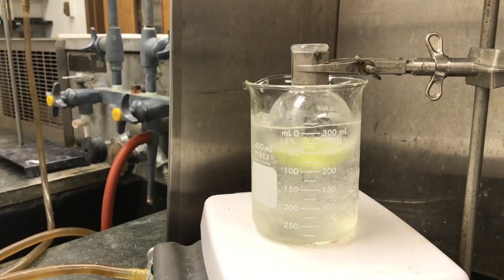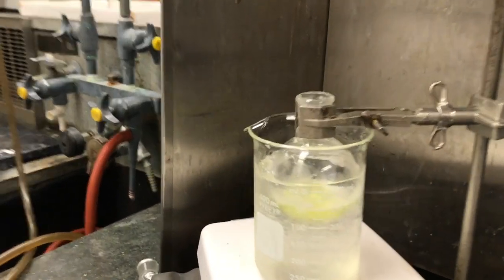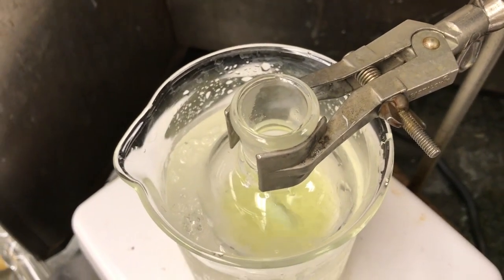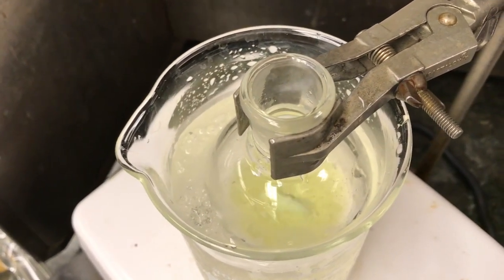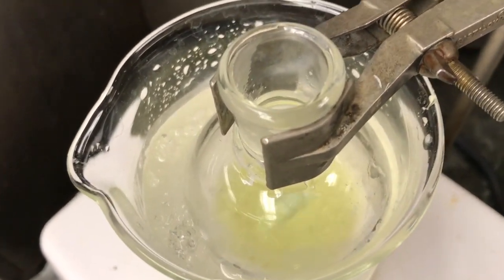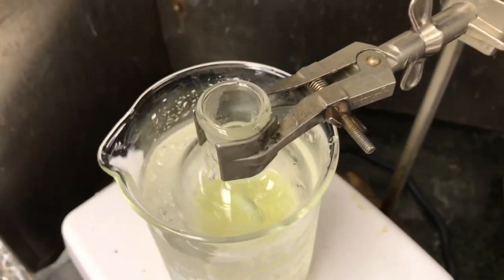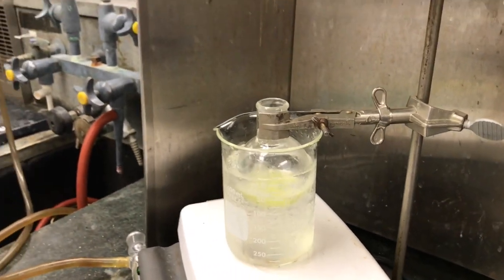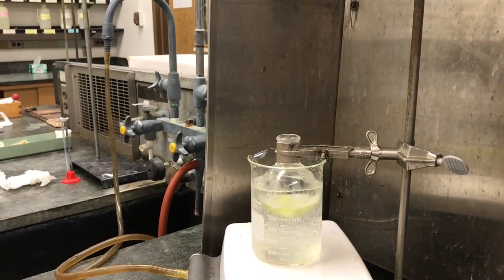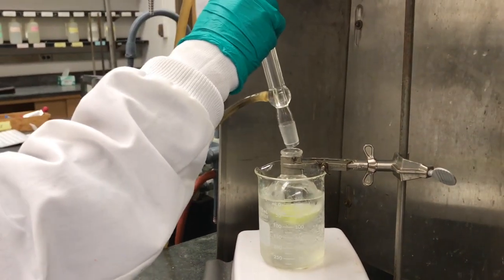There might be a few bubbles in there that might throw you off. If you can see there, some of that is ice and some of that is just little air bubbles. It's mostly clear. Okay, so right now we're just going to add the reflux condenser and keep stirring that for another 30 minutes. Once the 30 minutes are done, we'll be back.